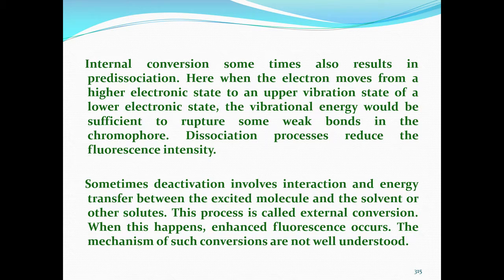So, whenever a substance loses its energy by some interaction with some other molecules, not of its own molecule, then it is known as external conversion.